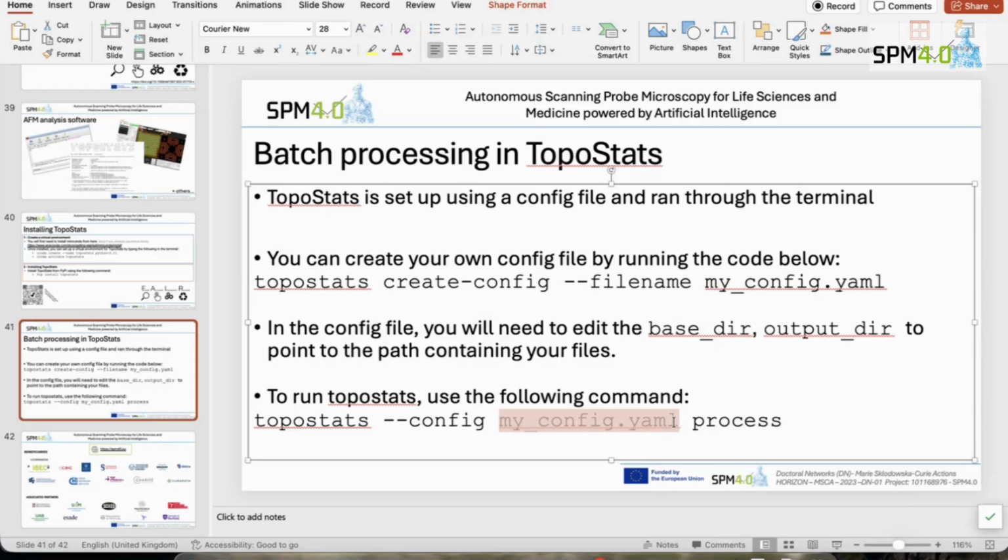Since on the other side spaces that. He's gonna, this is different. Did you put a soft panel in here as well? Because otherwise it's just gonna. That might be everything to think about. No. Yeah. It's got new code. And it's not installed, it's planning it. Is it installed in there? Yes. You want to be there. Be there. Oh, yeah, definitely.